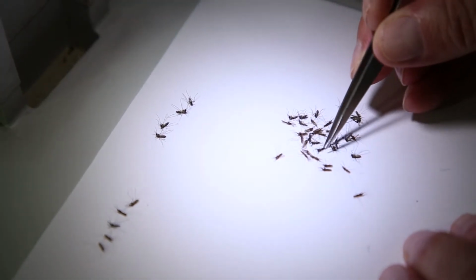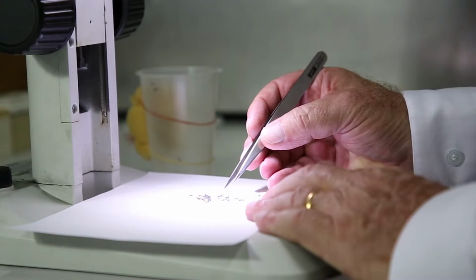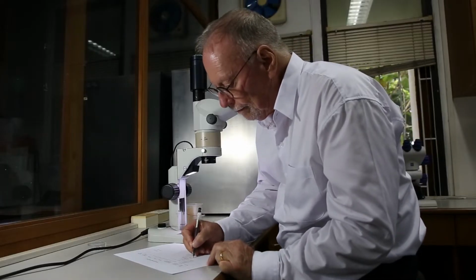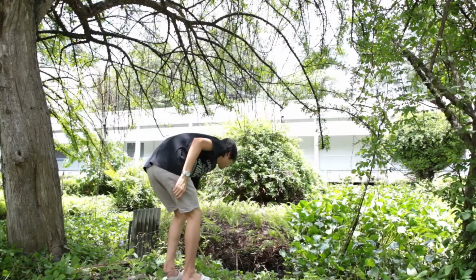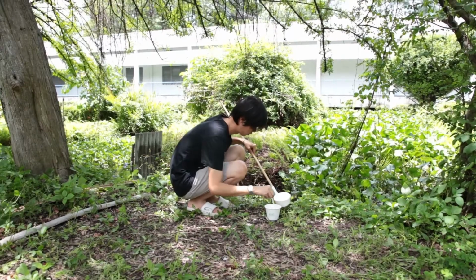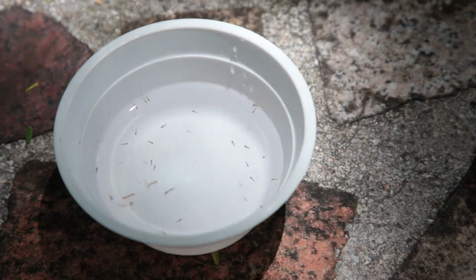Firstly, you can rear the larvae through to the adult stage and then identify the adults, which many entomologists prefer to do. Or, secondly, you can preserve the larvae and do direct microscopic identifications of the larvae. If you decide to rear the larvae to the adult stage so you can use the adults for identification, you will need to keep the larvae in containers until the adult mosquitoes emerge.